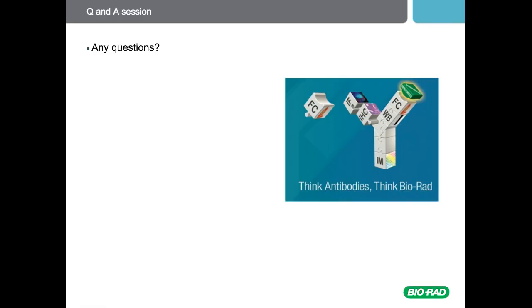I've got a question here. Can you use FITC for surface staining if you then intend to do intracellular staining afterwards? And the answer to that is yes. FITC is very good for surface staining. However, as I mentioned in the webinar, I would not use it for intracellular staining. You may get some reduction of your fluorescence when you fix, but as long as you have the right controls there, you should be able to account for this.